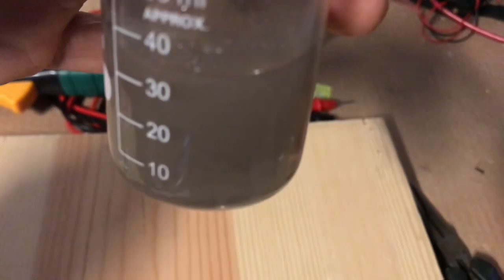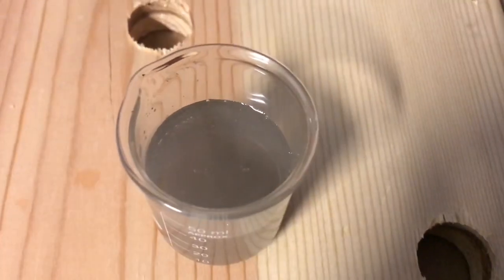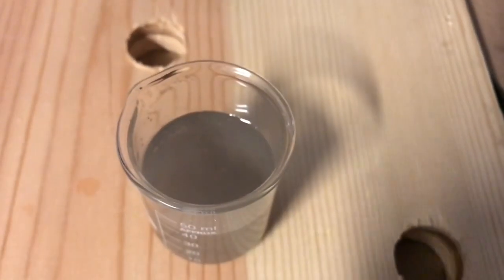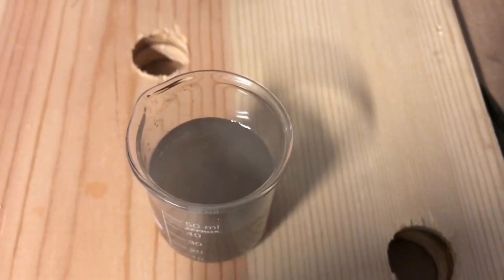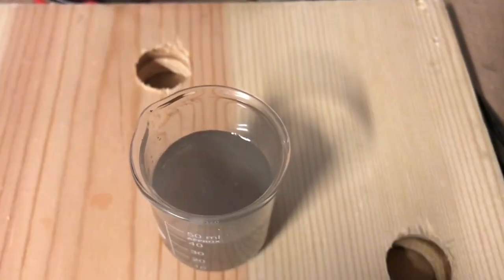You can see it's turning this kind of gray color which is due to the presence of aluminum oxide and gallium particles in the water. The gallium can actually be recovered and used again, and this is the basis for some kind of gallium aluminum hydrogen fuel cells.